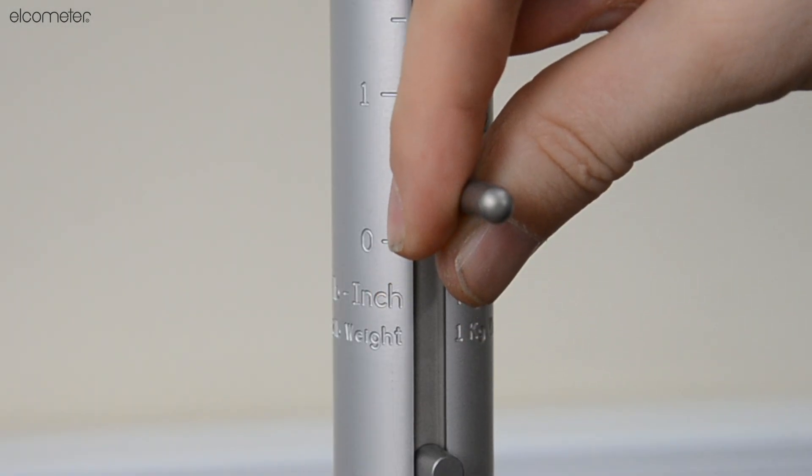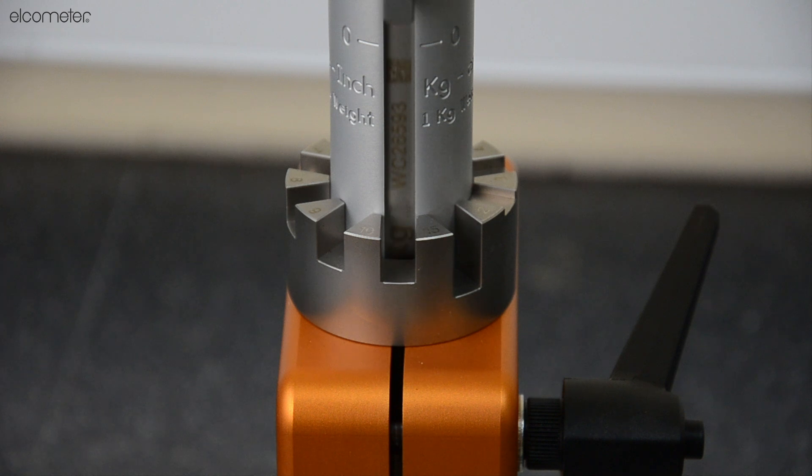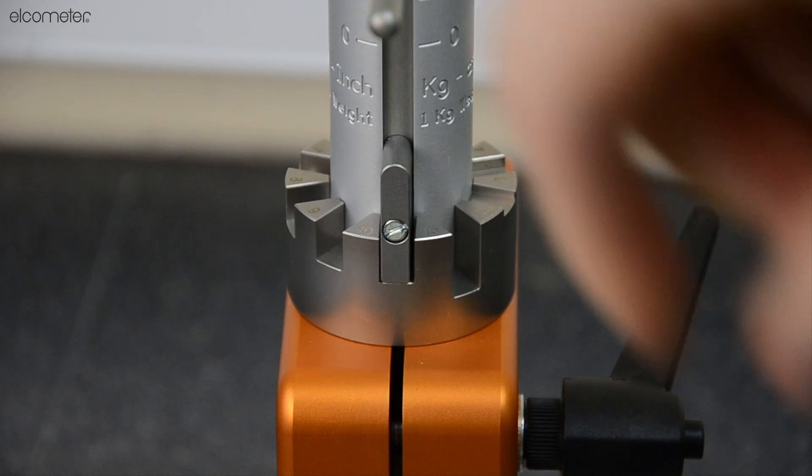Lift the weight until your desired depth is aligned with the slot in the guide tube, then lower the weight onto the locating pin at the base. This ensures your falling weight is correctly aligned.